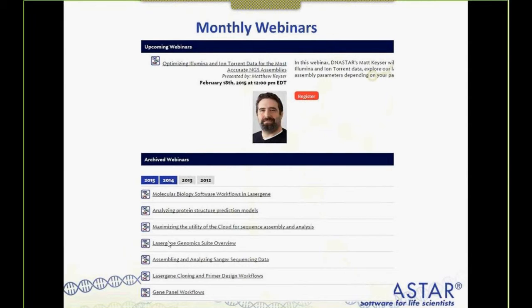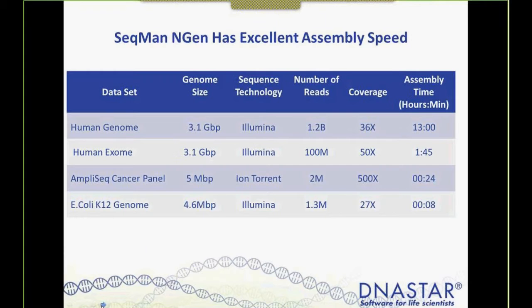My webinars are typically focused on NGS, but we have other webinars on things like structural biology and different molecular biology tools that are available in our suite. So if we don't cover things today that you're hoping we could cover, certainly look at the archived webinars, and we may have covered that topic recently.